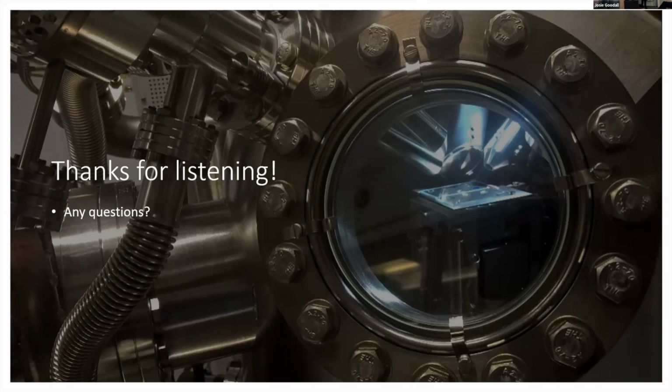Are they stable or do they dissociate? Those were done a long time ago, on a monochromated X-ray source, so the intensity was considerably higher, which means you can use lower fluxes. I don't know how stable they will be in the sources at high power, to be honest. But they were stable under monochromated X-rays.